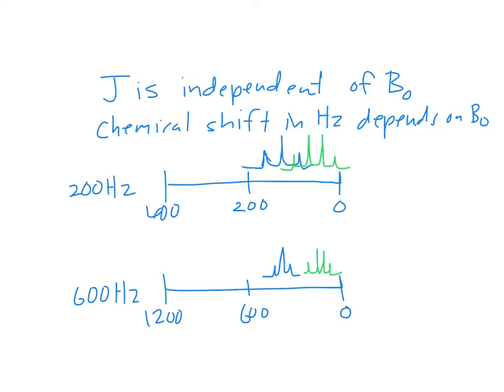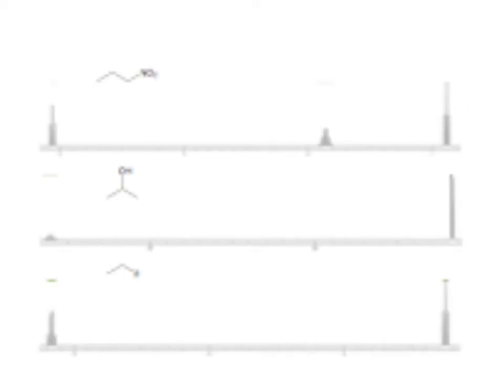Yeah, right. All right, so I ran out of these notes we have over here. Oh, so these are just some examples of some different coupling patterns. So here's just nitropropane. And I think this is kind of the average thing for the ones in the middle.